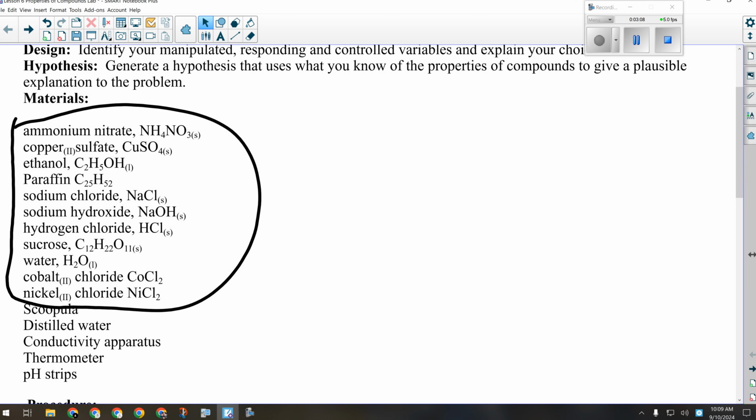Because we got a little pressed for time and we really shouldn't have. Stir it for a minute. If it hasn't changed color, changed size, shrunken, all those things that would indicate dissolving, it's non-soluble. You don't need to stir it for more than a minute. Remember you also need to take the temperature while you are doing that solubility test. A number of groups neglected to do a good job of that and missed some vital data. So make sure the thermometer is in there when you're doing the solubility test.